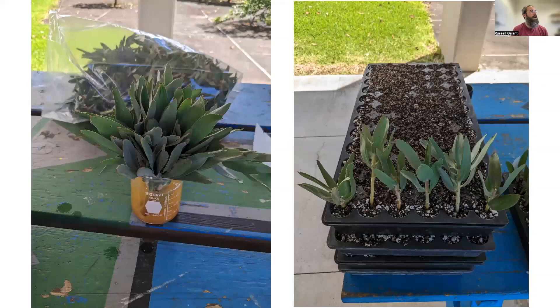I used a two-times diluted one percent IBA mixture, so it's a 0.5 percent IBA mixture that you're looking at there. You can see in the image on the right what the cuttings will look like when stuck into the media, and I do that for every single cutting.